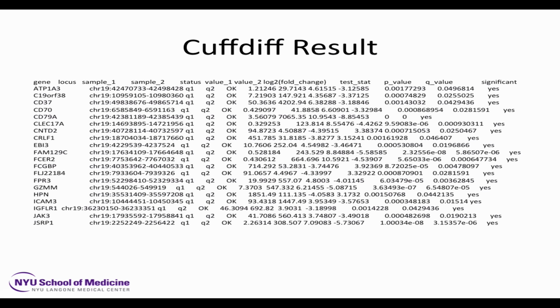So if you submit a series of samples for 2 groups, it'll be more valid. Much more valid. Real, publishable statistics. Although, as I said, there is disagreement, but no one disagrees so strongly with TopHat that they would say your results are invalid. They would say they might be a little over-rich in false positives.